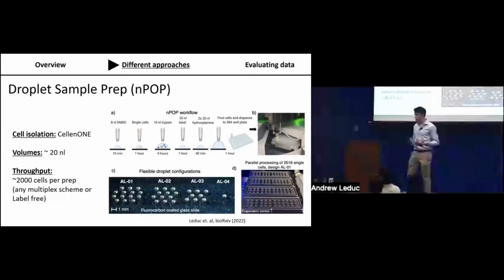So we're not using it in a quantitative sense, like looking at high or low expression and then mapping that to the single cells. But the image data can be interesting. In fact, Jason Derks in our lab has worked a little bit on trying to tie the images themselves to understanding something about the proteome. And again, the quality of these images depends a little bit on how clean your glass capillaries are before you start the sample prep, and a couple of other things. But I think it can be really useful to tie in more of this information, and hopefully in the future we'll work along those lines. Thanks.